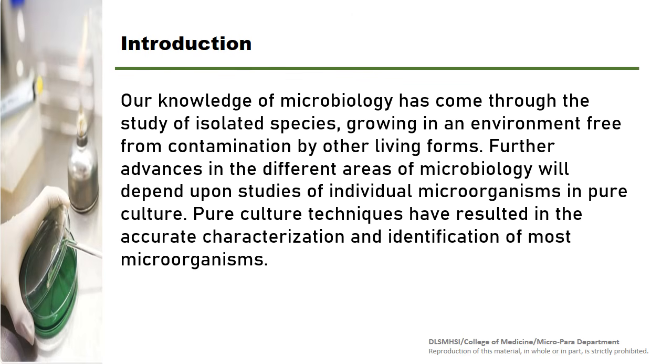Our knowledge of microbiology has come through the study of isolated species growing in an environment free from contamination by other living forms. Further advances in the different areas of microbiology will depend upon studies of individual microorganisms in pure culture. Pure culture techniques have resulted in the accurate characterization and identification of most microorganisms.